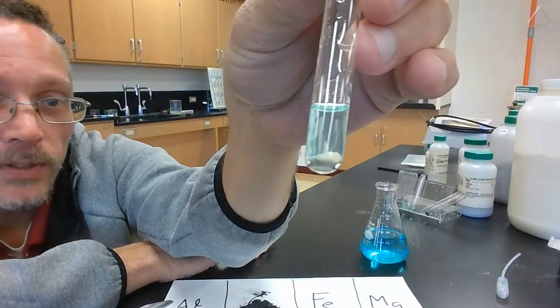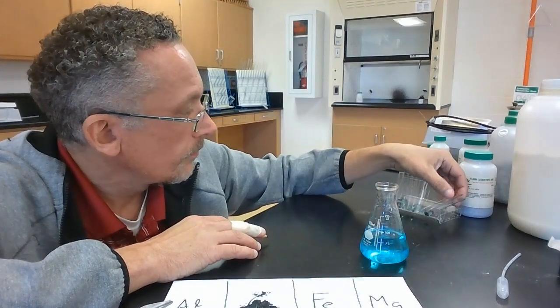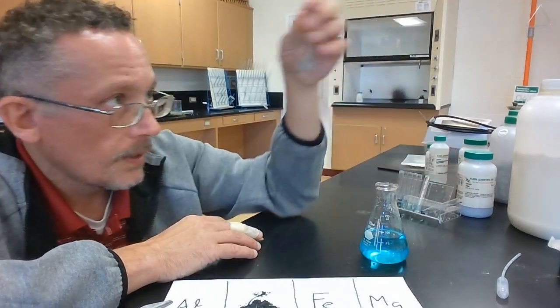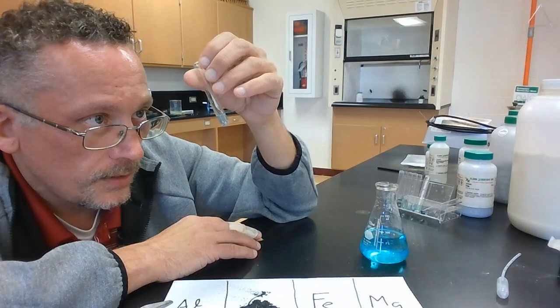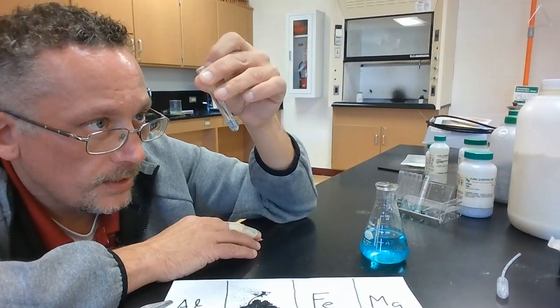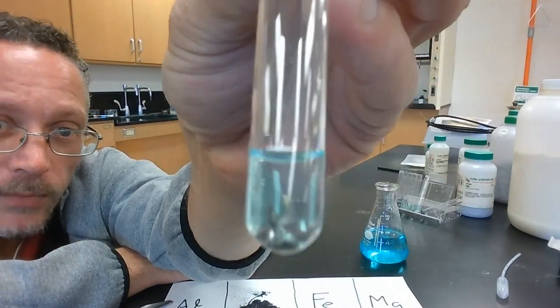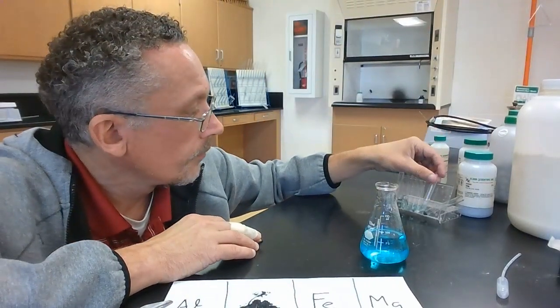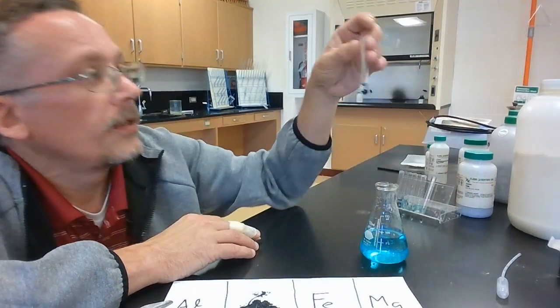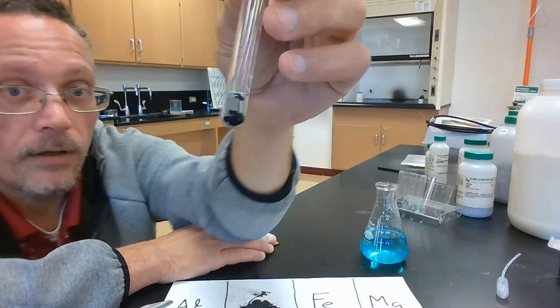There's nothing going on with the sulfur here. The tin, there's a couple of bubbles on the tin, but not a whole lot. And the zinc, well, the zinc's turned all black.